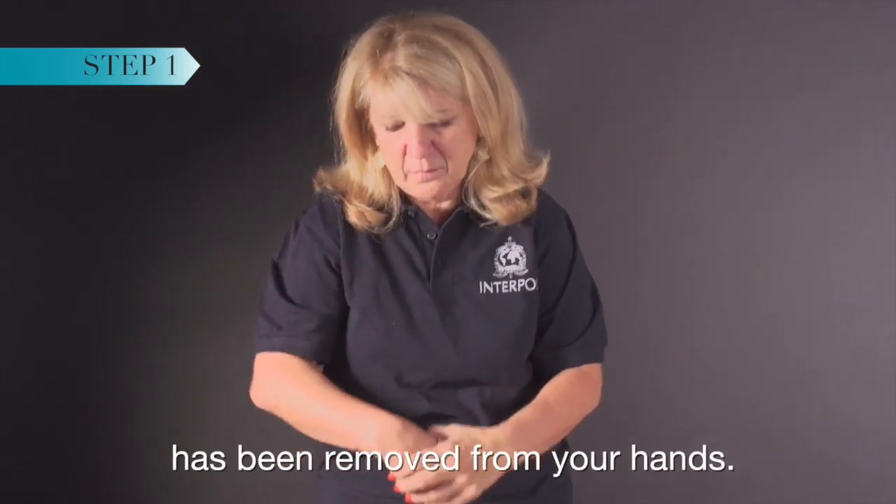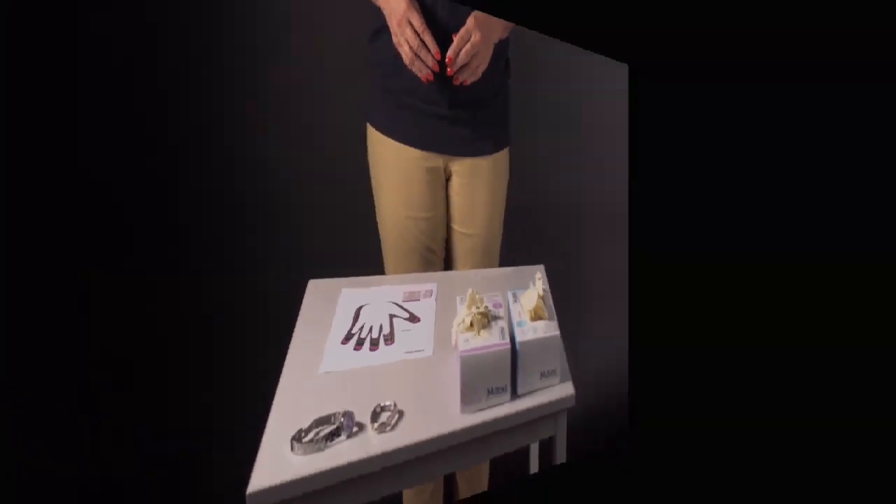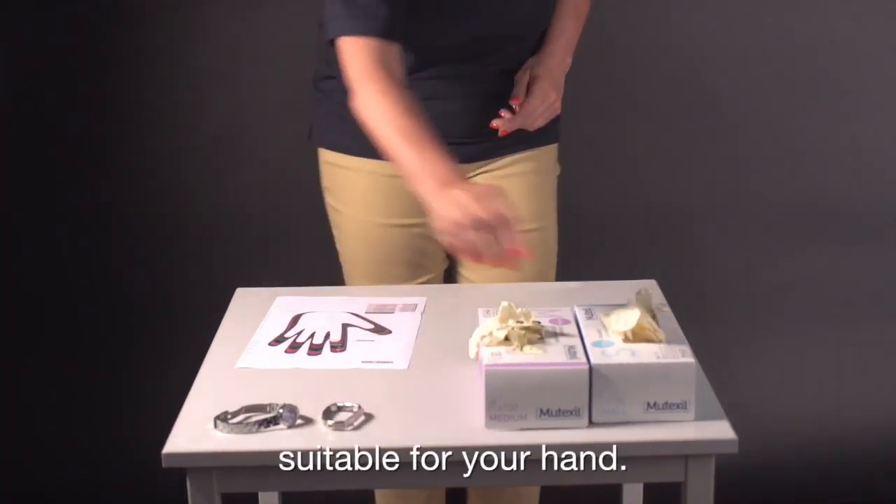Ensure all jewelry has been removed from your hands. Using the hand chart, select the correct glove size suitable for your hand.